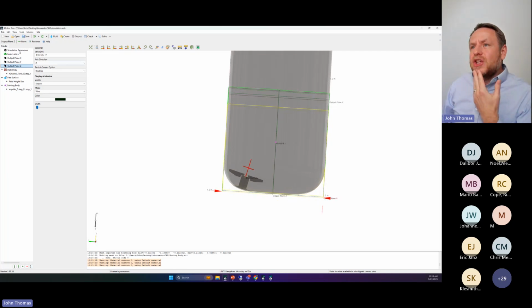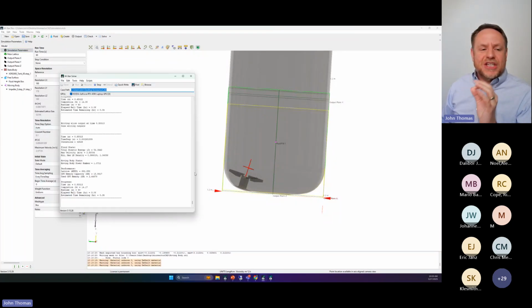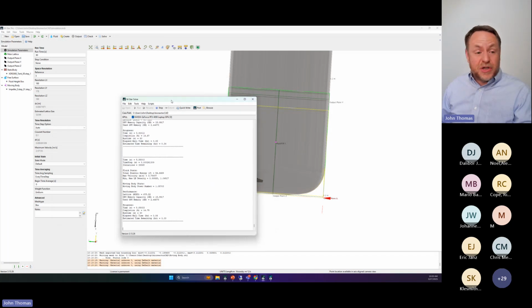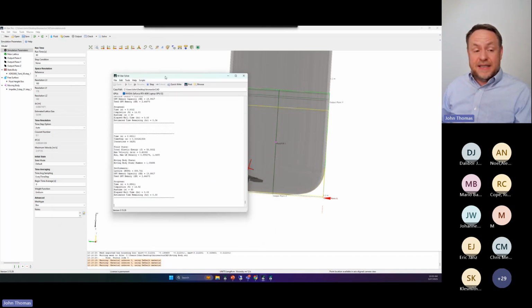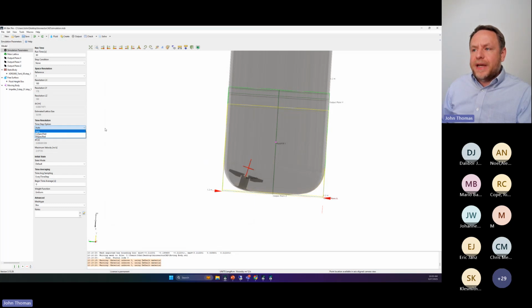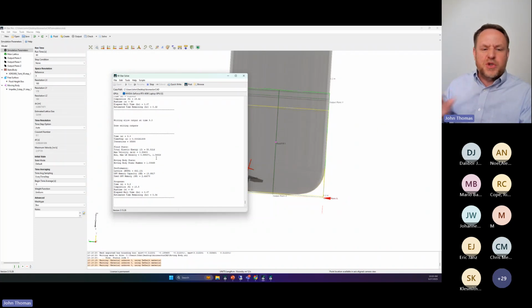thought. You'll notice here that I use the default time step, and those who know M-Star understand what this means in terms of Courant number. The discerning M-Star user might have said, well, John, your LB density is good, not great. Yeah, I've got about a 5% variation. This is because M-Star is explicit, and so it's by necessity quasi-compressible. If I drop my time step a bit, I could get rid of that compressibility.